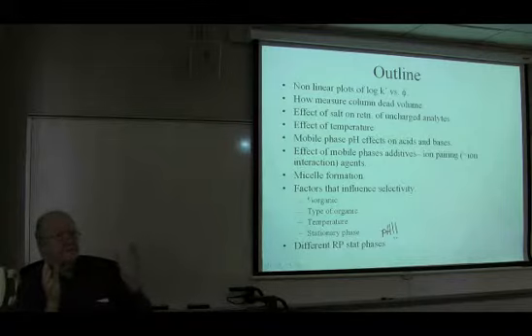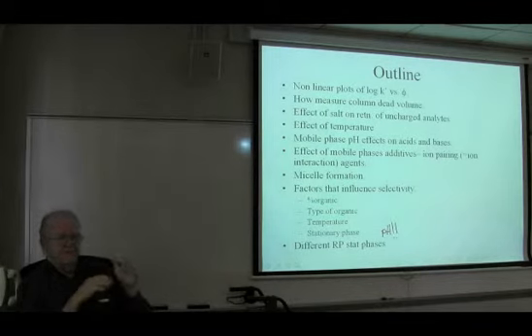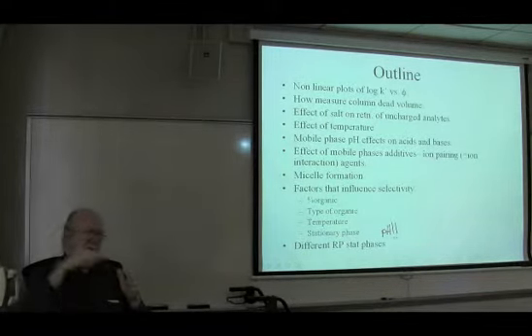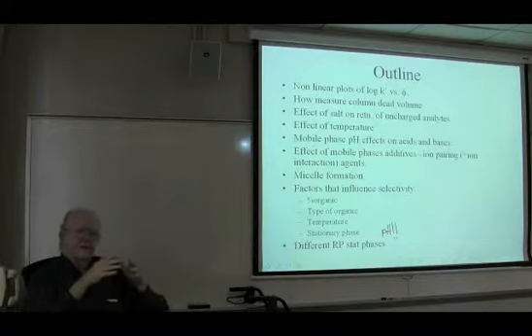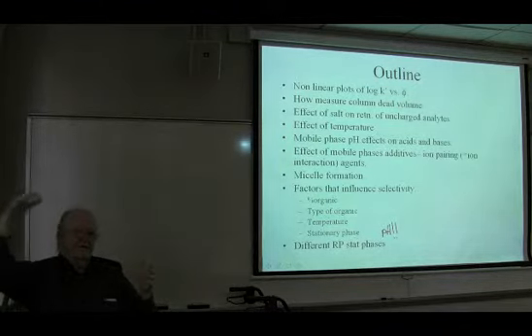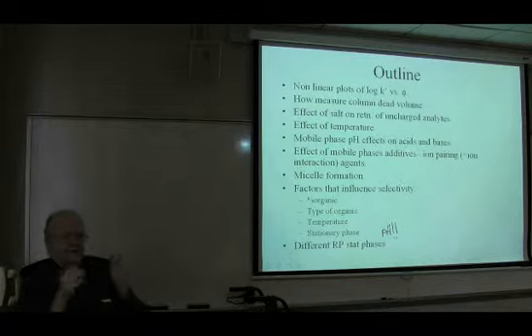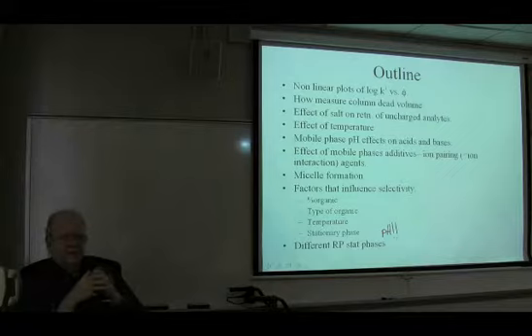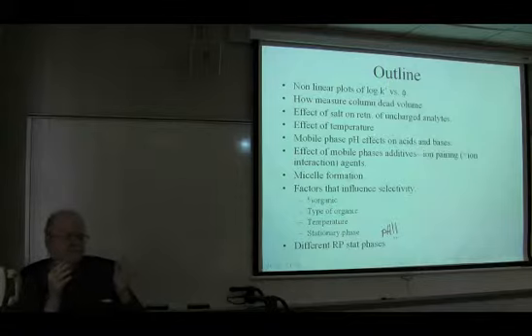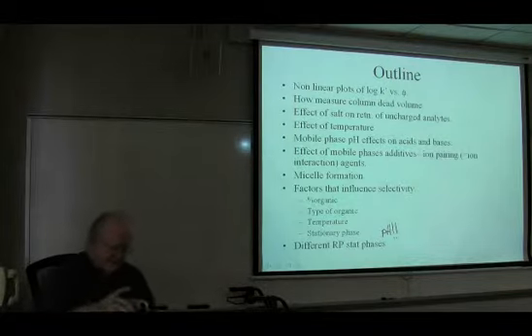Generally speaking, the bigger the molecule is, the bigger the slope of that plot is. So for instance, as you go up a homolog series, that slope increases. As you go from a monomer to a dimer to a trimer, up a series of polymers, the bigger that slope is. For big polymers, be they synthetic or biopolymers, you can see slopes there that are 20, 30, 50, meaning that those compounds are exceedingly sensitive to minute changes in the mobile phase composition.